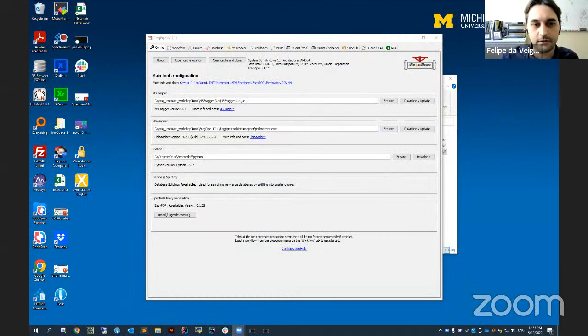You can run FragPipe on Windows and Linux machines. We don't fully support Mac for technical reasons, but the program should be fully functional on any Windows or Linux version.